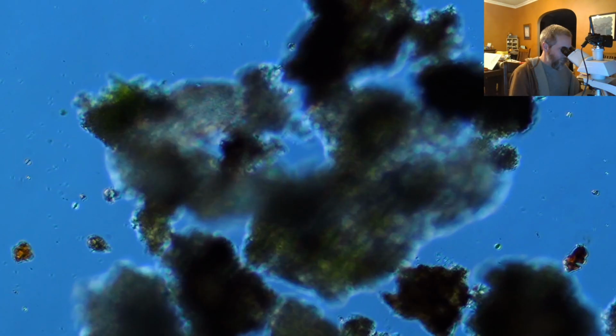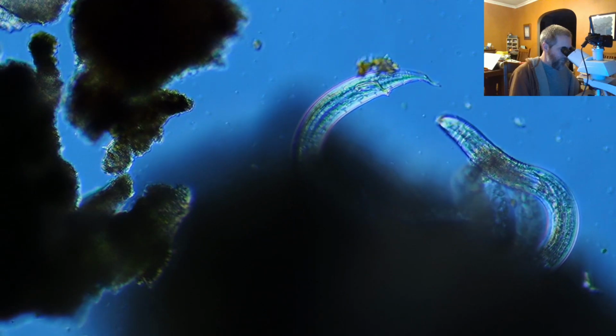Getting close to the end of this side, and it's like all of the activity is really on the other end of this slide, which is kind of weird, especially considering I've added extra water to the slide, and I think I added it on this side. It's like this side has all the nematodes and that side has all the other things. Somehow just ended up that way. There's a big old nematode right there. Snake eating its own tail.